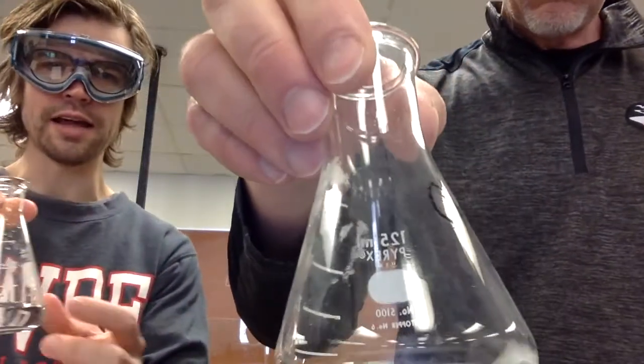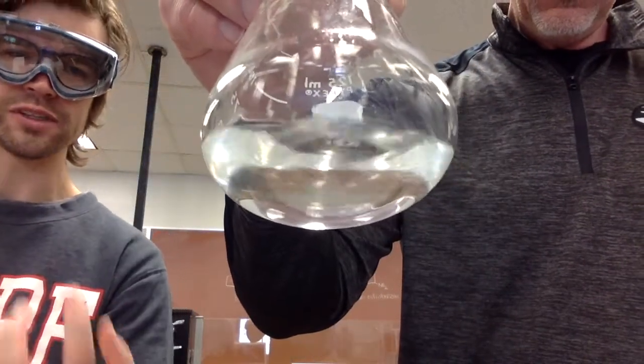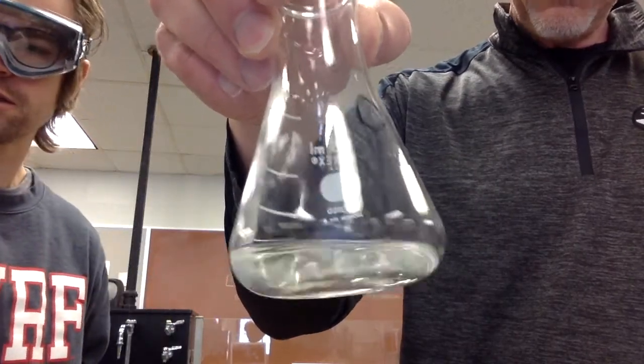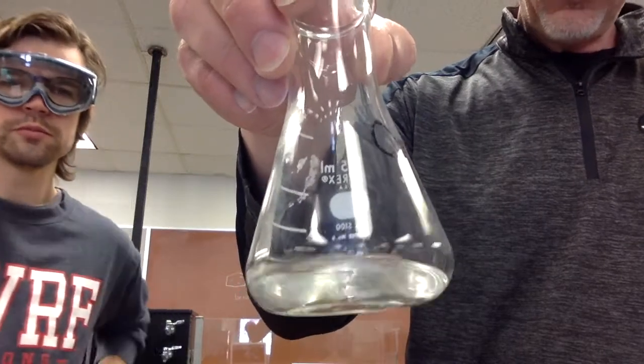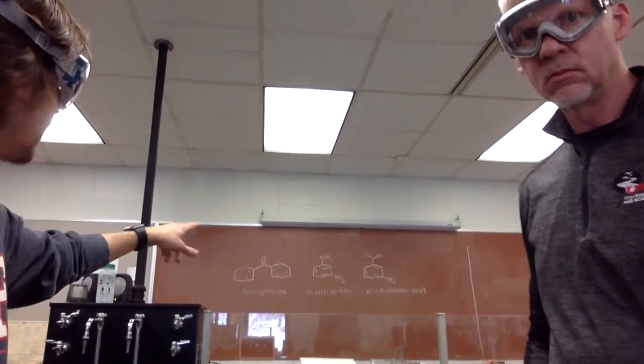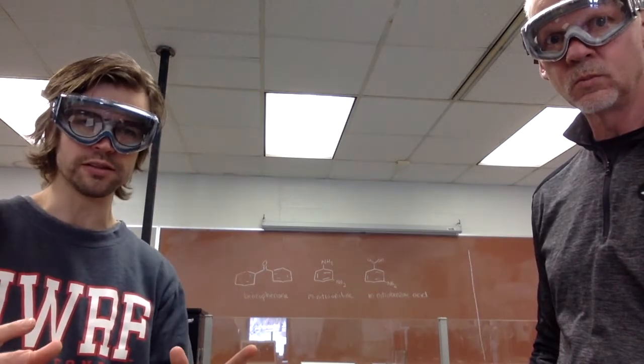And one thing that happened in this last extraction was that with the aqueous acid, after we added that, the organic layer, it was a yellow color, and now it's clear, so something must have happened to cause that color change. Some chemistry going on there, so we had a color change from yellowish to clear in the organic layer when we extracted with that aqueous acid. So it's always good to think about, when we have our molecules in the background, what the heck is happening to these things when we're treating it with sodium hydroxide? What's happening to it when we treat it with an HCl solution? So that's what we should be thinking about. How are these molecules being modified, and how would that impact their solubility?